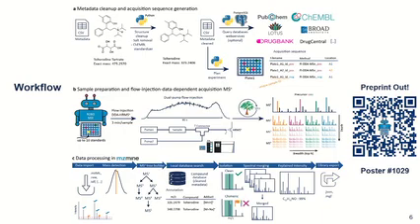There's also a script to do the sequence generation, but so far it's only for the Orbitrap IDX, but it might also be adjustable depending on your instrument and how the sequence needs to look for the acquisition in the end. We then have this sample preparation workflow, so it's everything that is done in the wet lab. Luckily we had a robot to prepare our samples, so we always mixed up to 10 compounds in one well, and then we had 384 well plates or 96 well plates, and in each well up to 10 standards mixed.